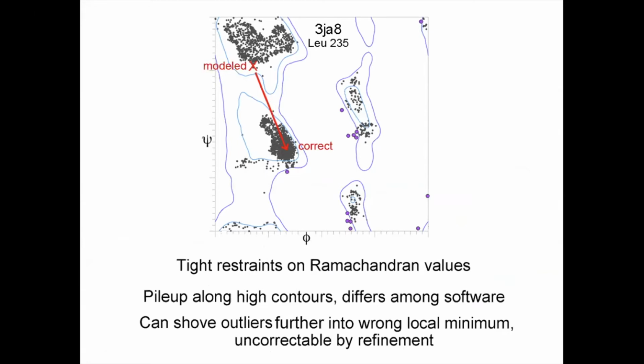So when you have a misoriented peptide, the phi and psi on either side of it will be wrong. In the peptide preceding that residue, you'll get the psi really wrong, and in the one afterward, you get the phi really wrong. And so you tend to move on this map either up and down 180 degrees or back and forth 180 degrees, which will take you at least close to the wrong local minimum.